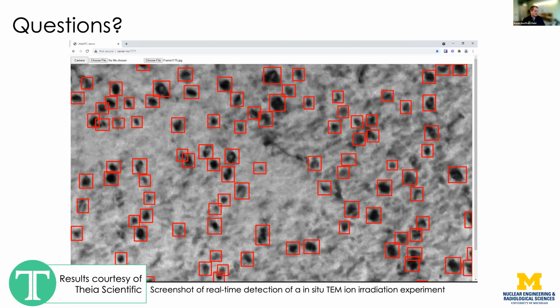I call it a black art, but there's a whole science associated with it. Even our additive manufactured samples will flash polish differently than conventional samples, even for the same composition. So there's a whole process that you have to do every time.